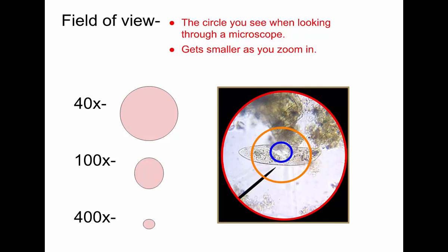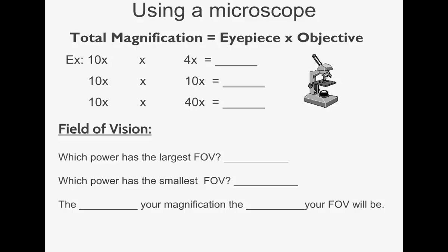Also in these microscopes, there's this pointer. It looks like a needle. It's a part of the eyepiece. And it's used so you could point something out to someone. You could rotate this so the pointer is pointing right to someone and say, hey, what is that part on this amoeba or whatever?